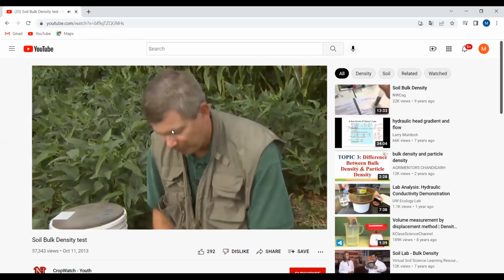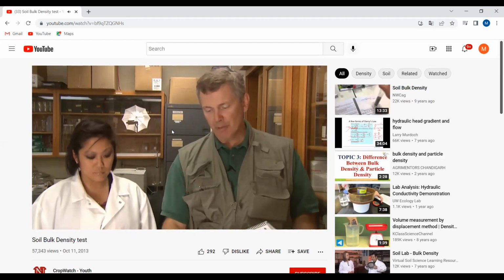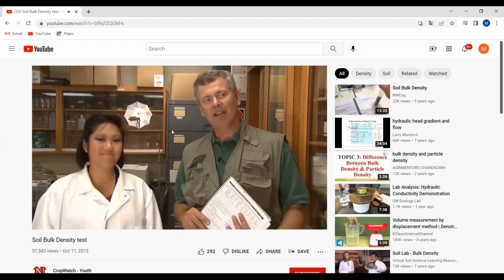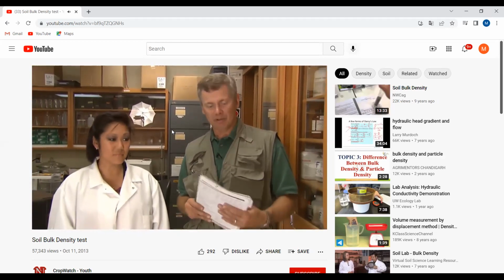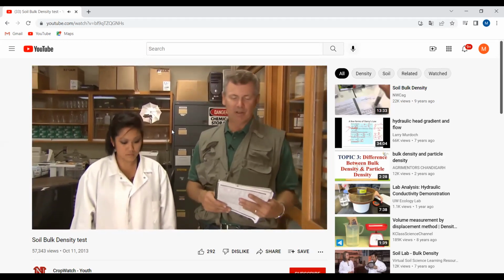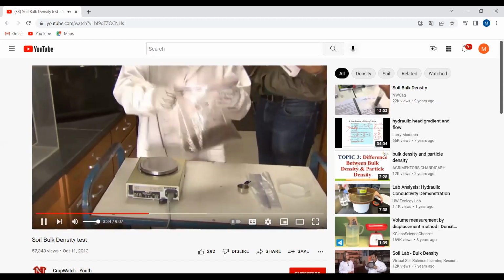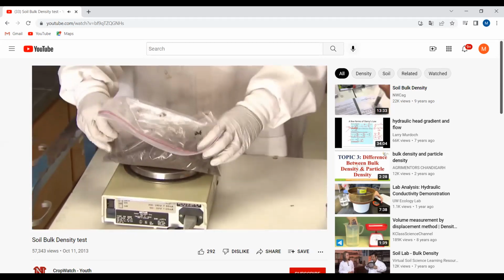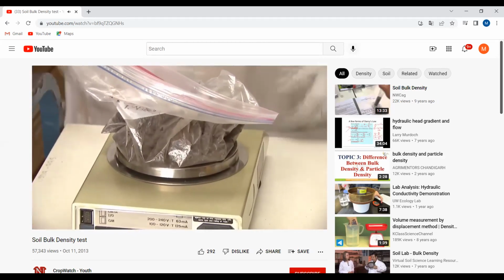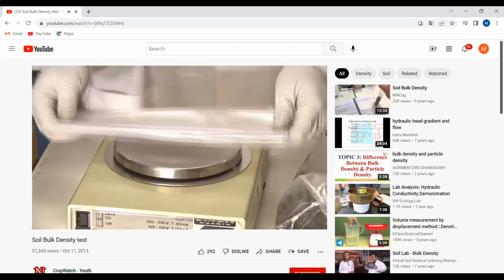Now we just got back from the field, and we have our sample that we pulled from the bag. Virginia Jen, research soil scientist with ARS, is going to help us through steps 6 through 11 in the guide. The first thing we're going to do is weigh our sample bag with the soil in and record its weight in table 2. The next step is to weigh an identical clean empty bag and record that in table 2.